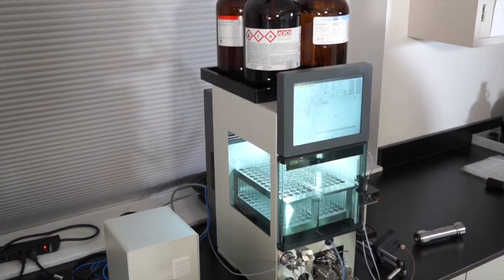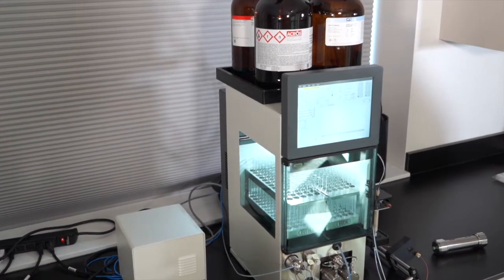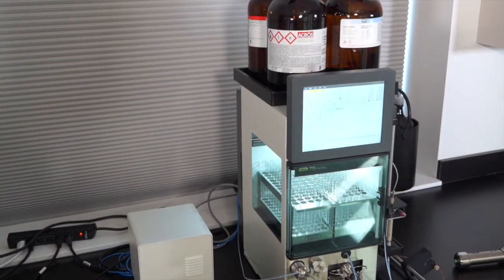But first I want to point out how small and chic our instrument looks. This thoughtful compact design saves valuable lab space which is important for scientists seeking to maximize their workspace, allowing them to set up more reactions or fit other essential equipment.